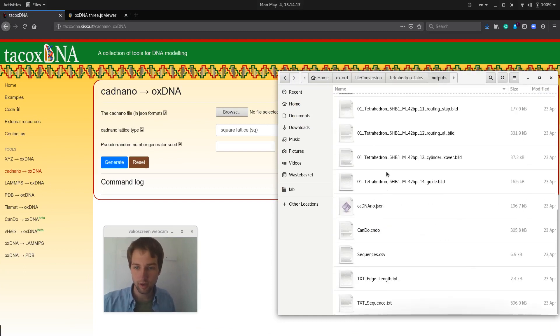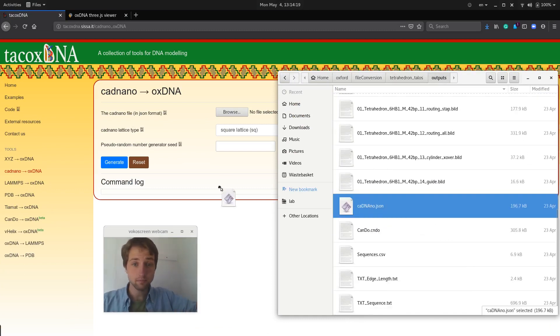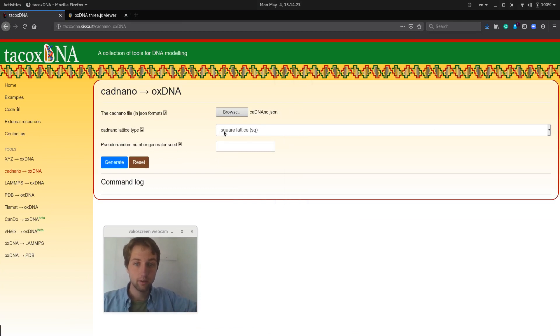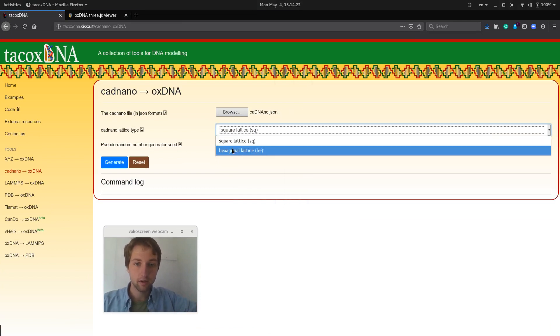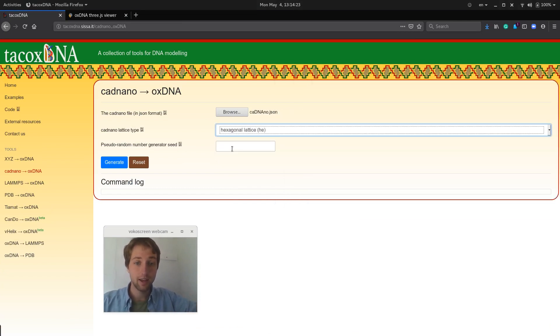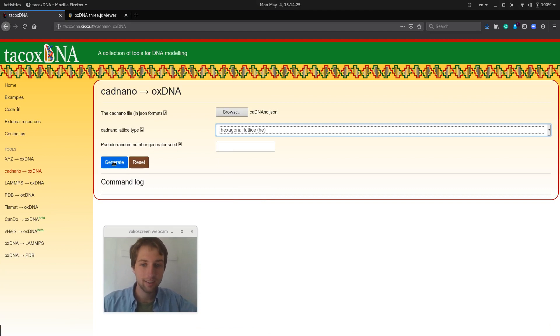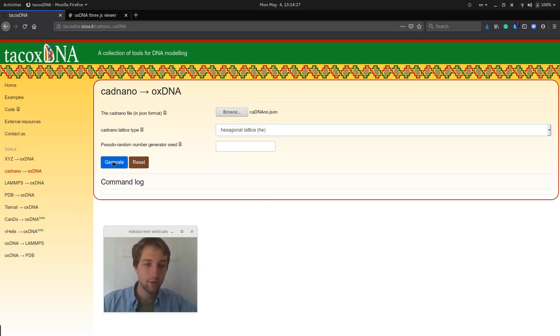So the first step is basically to find your JSON Cadnano file, I have it here, and then we select the hexagonal lattice, since this is a hexagonal lattice, and we click generate.